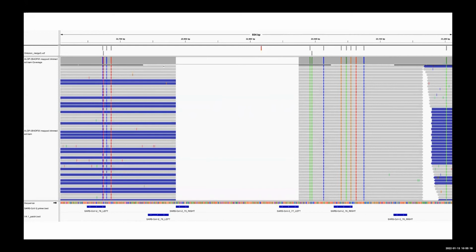And that's, I think, quite useful going forward, because generally speaking, it's easier to order a few patch oligos and replace a few rather than revalidating the entire scheme, where you have to address any potential bad primers or interactions which you haven't detected, and solve those problems. So repair, I think, is definitely the future, and it's the first time that we've used that with ARTIC version 4.1, and so we released 4.1.